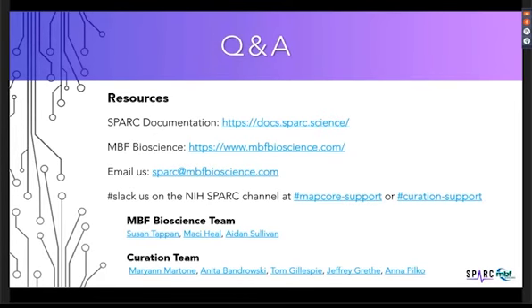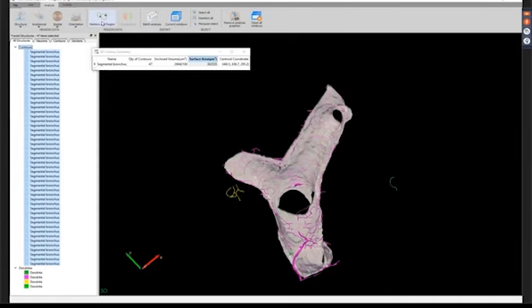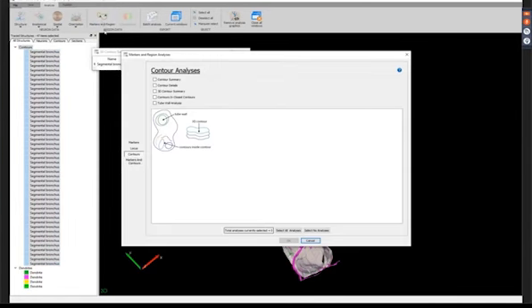Another question here, for the surface area contour selection in the 3D window that gives information on the dimensions of the structures, do the contours need to be closed? To do closed surface analysis, yes, they will have to be closed contours, but you can still get some information about the open contours as well. So if we select contours, region, we can get details about the contours.